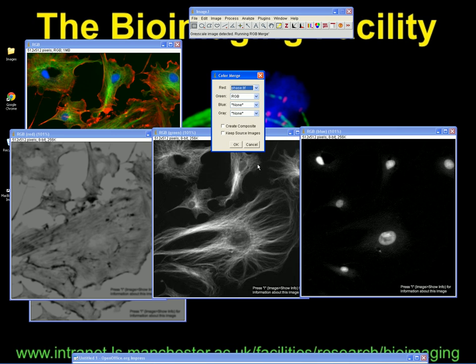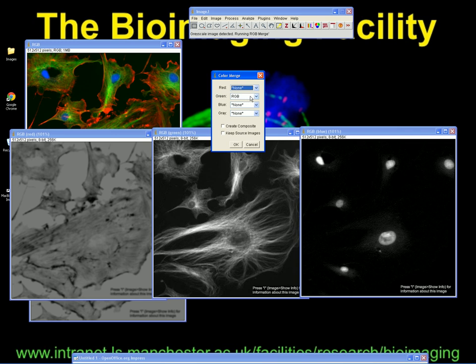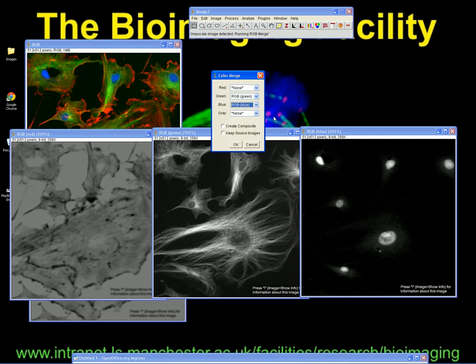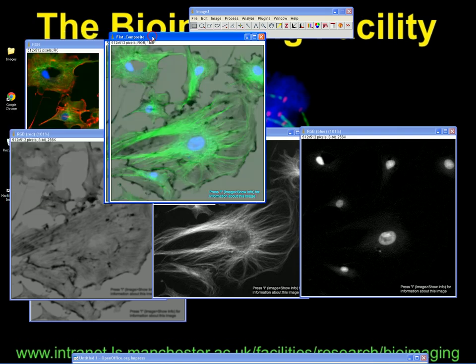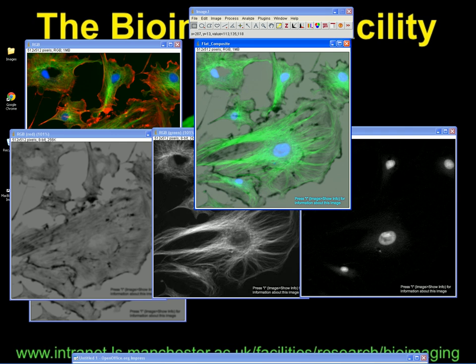What we can do is first combine the two colours together to get the merged fluorescence. The red channel — we don't have one, so we put that as none. The green was this one here, so that's RGB green. The blue channel was the DAPI channel — that's RGB blue. And the grey channel is actually this one here, the RGB red, even though it was brightfield. Keep source images. We don't need to create a composite at this point. When you click OK, you have the merged grayscale image that we want to work with.